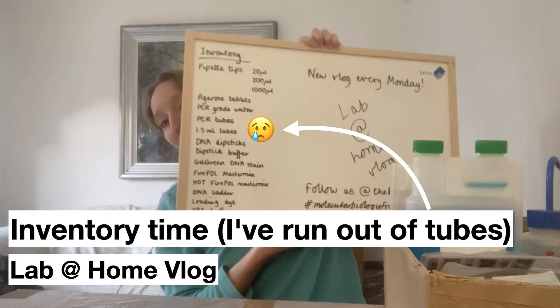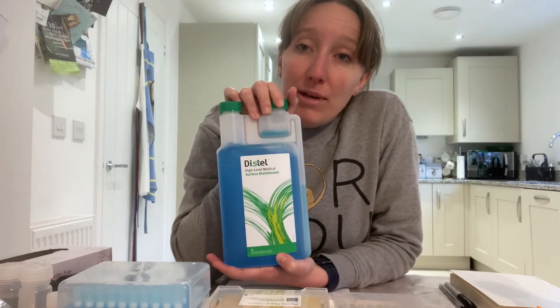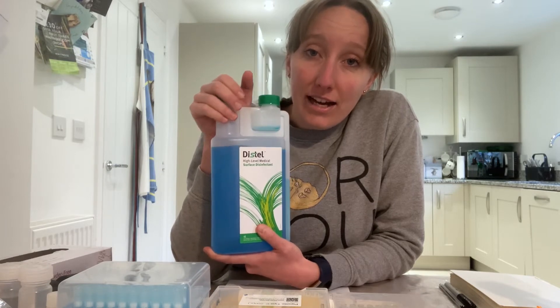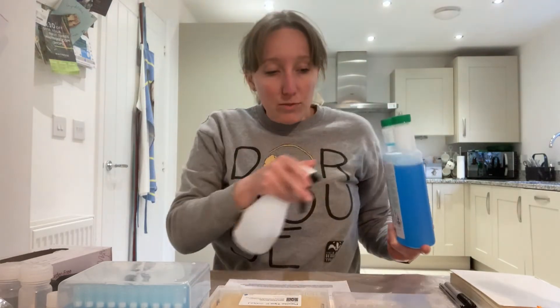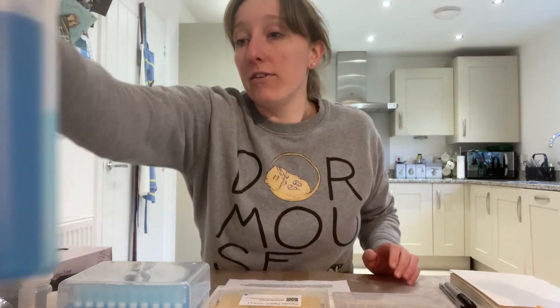I have a few tips to pass on from my time doing molecular biology at home. The first is to do with keeping your workplace sterile. I'd really recommend investing in a bottle of Distel surface disinfectant. Be careful when handling the concentrate because it is a skin irritant, so please wear gloves, and invest in a spray bottle so that when you dilute the concentrate into water it's easier to apply. I always just spritz my work surface down and wipe it before I start an experiment to prevent contamination between different experiments.